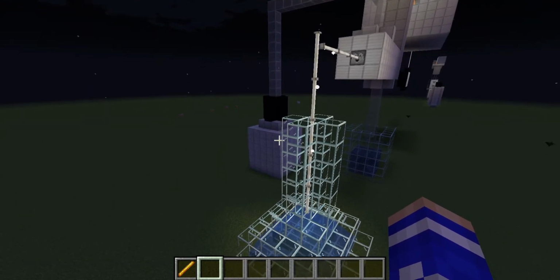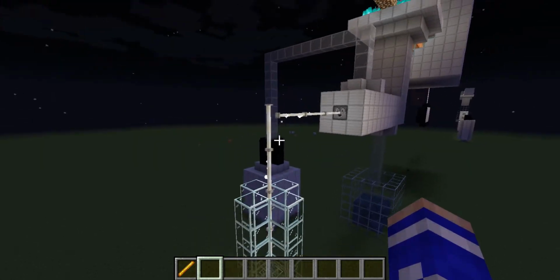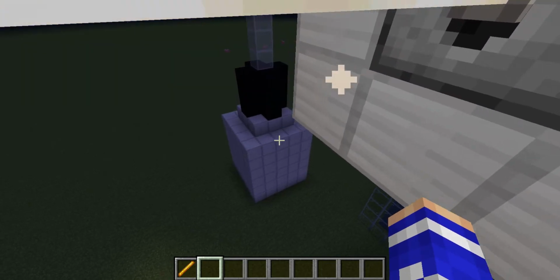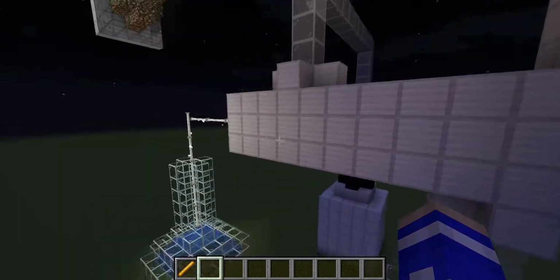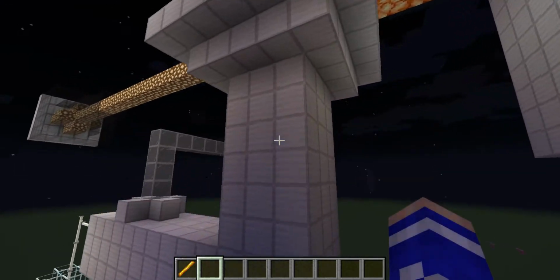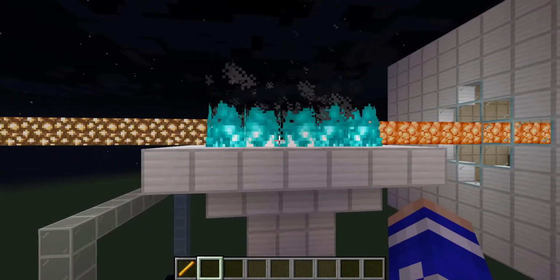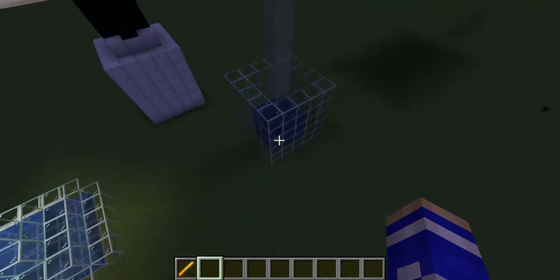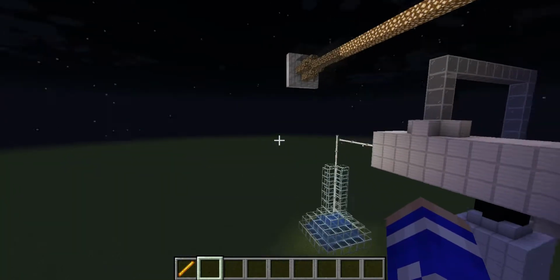The sample will get drawn up through a capillary tube into a spray chamber where it will be mixed with our gas. That will travel through this system where it will get ignited in a flame burner. Down here we just have our waste where any liquid sample goes.